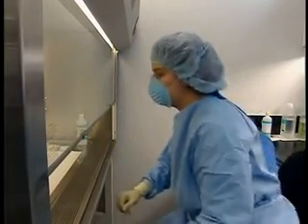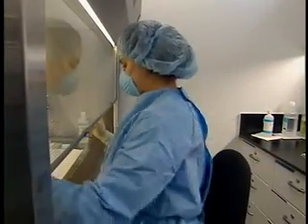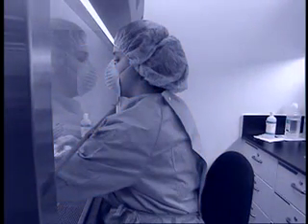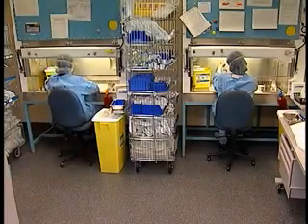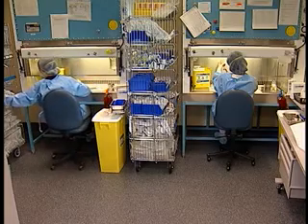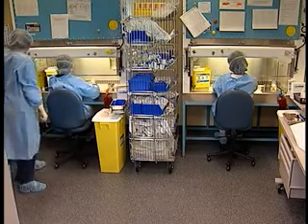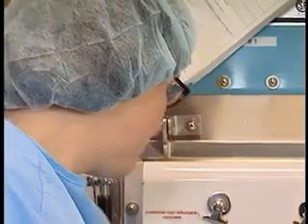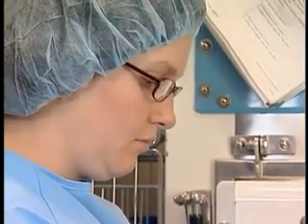But first, a reminder of the potential routes of exposure and contamination by antineoplastic products to the handler. Inhalation of particles or aerosols, accidental ingestion, self-inoculation by an accidental needle stick, skin contact. Antineoplastics and other cytotoxic products must be handled in a room designated for this purpose only. It is imperative that all necessary safety measures be observed in this room. By applying the recommendations described in this video, we will see how this is accomplished.